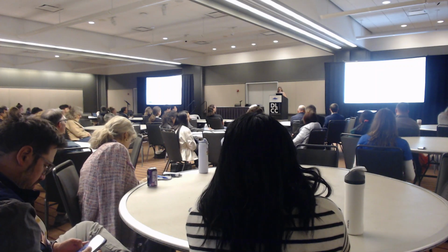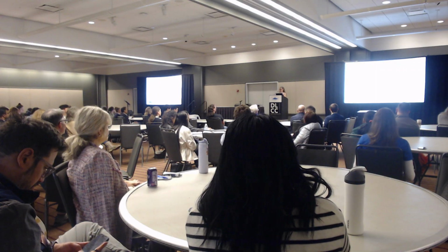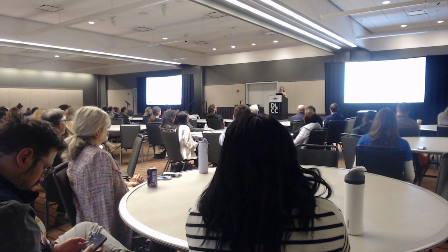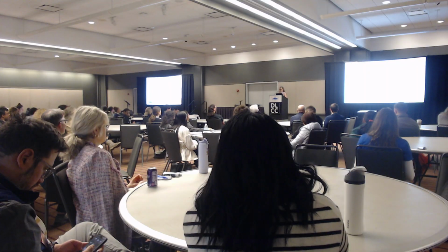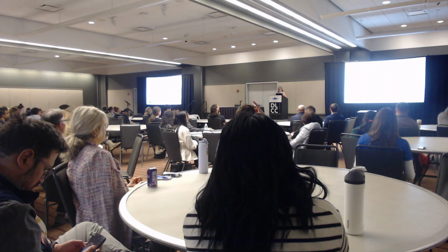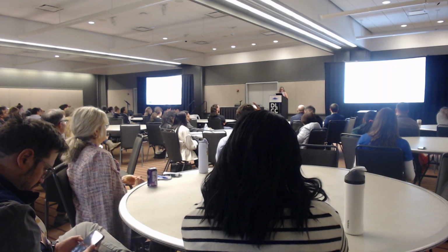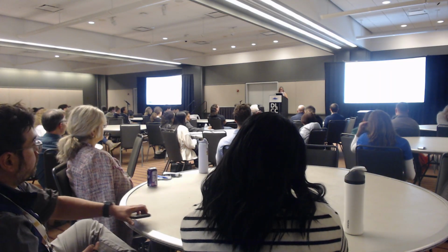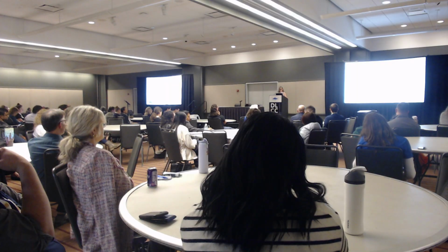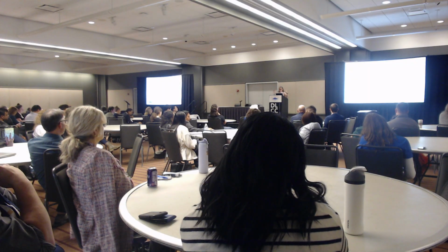I've tested all the other things, but for the sake of time, I'm not going to go over them. That shows how you can leverage long-term collaborations. You don't need to be in epigenomics; you know your investigators you've been working with, you do the consultations, you talk with them, and they will be more than happy to work with you. Specifically for this assay, yes, it does measure both modalities. And the nice thing is that as a core, we're able to develop an added value to what the kit offers, shown by implementing this dynamic change in methylation into the pipeline.